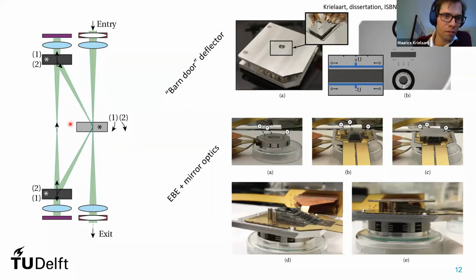And here we have the electrostatic deflector that we use to insert and remove the electron from this side axis. You can see here it's a SEM and a photograph image. It's just a very elongated slit deflector that we use, and then one of these tubes on the side coincides with this axis, and that's where the electron returns through, and it bounces from mirror 1 to mirror 2, for instance. So it just gives you a feeling of how close this is all together.